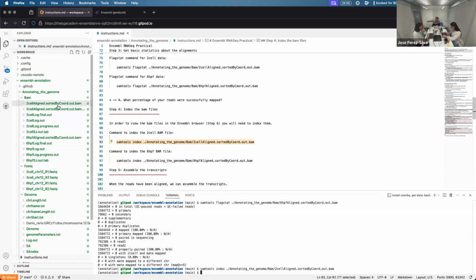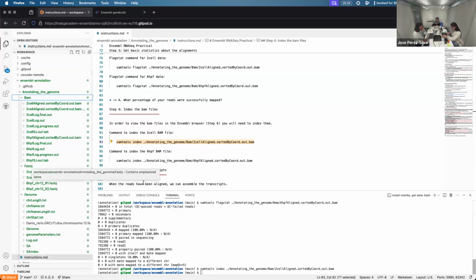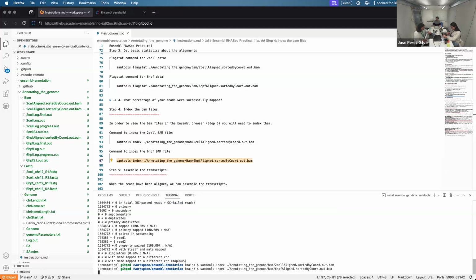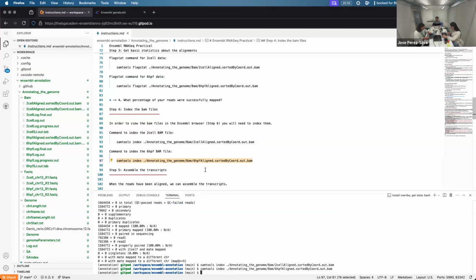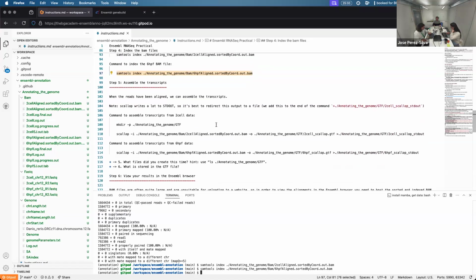Super quick. And again, you can see that a new folder appeared, or should have appeared. Oh, no, sorry, because we are, again, indexing first. So the only thing that will appear now is the index. In fact, this cannot be a simpler command. We are asking some tool to index this one and this one. Okay, again, once per different tissue, or in this case, developmental stage.